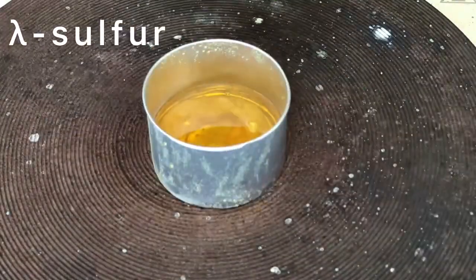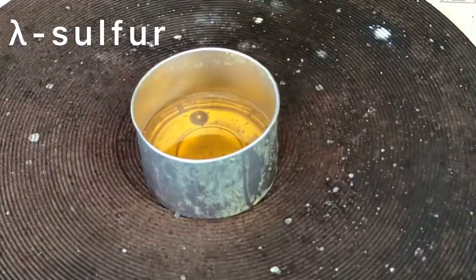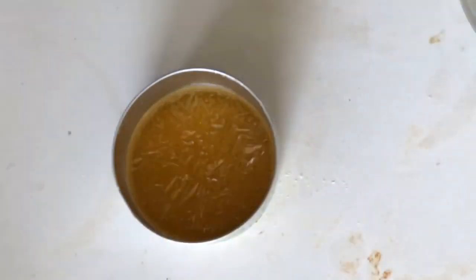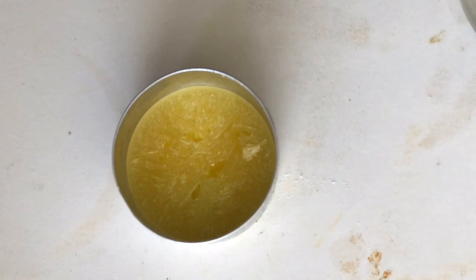When slowly melting sulfur, you are going to get lambda sulfur at first. Here the sulfur rings are free to move. We took it off the hot plate and allowed it to solidify. Solid sulfur consists of rings of 8 sulfur atoms.